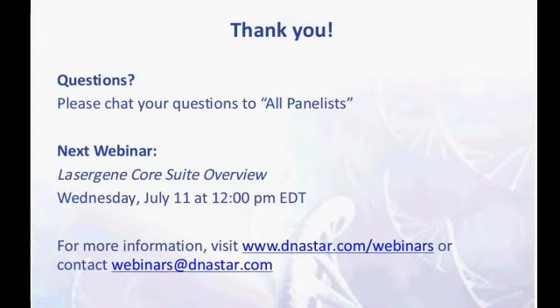We're getting just about out of time, so I'm just going to ask one question, which is: is it possible or beneficial to use a partial reference sequence if you don't have the whole genome to work with? Yeah, absolutely. So one thing that we will do here is take a genome package and cut it down to just a single chromosome. You can cut it down further and use GenBank files, or it might just be a small amplicon that you're interested in. So yeah, we can use all sorts of reference sequences.